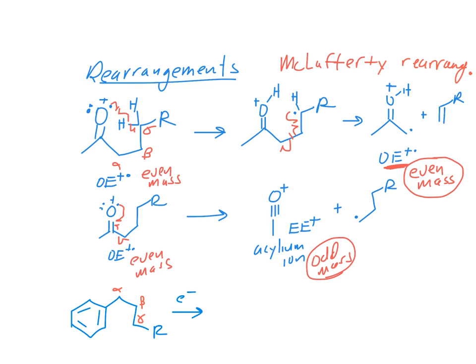If we're going to draw the ionization in a benzene ring, what we can do is knock out one of the electrons. Of course, this is all going to be delocalized within the benzene ring, but if we want to draw a fragmentation mechanism, we draw it with the electrons localized. So if we've knocked out one electron, I'm going to draw it with a plus at that position and a radical at the adjacent position. All we've done is knock out an electron from that pi bond.